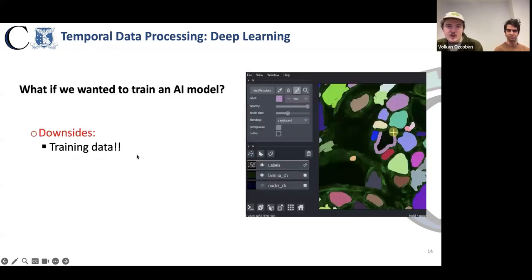The first roadblock we almost ran into immediately was creating a training data set. It has a very high upfront cost in all problems, and we had no guarantee any model we would create would work. It also is not an easy annotation task in the first place. Some domain expertise was going to be needed to properly separate out individual instances, and creating consistent masks across multiple frames is extremely time consuming.